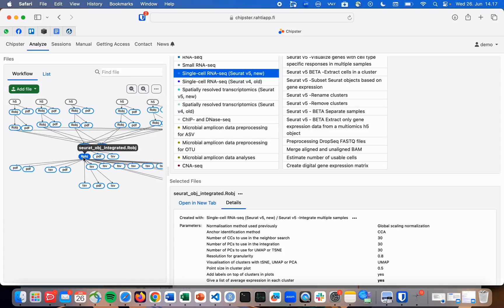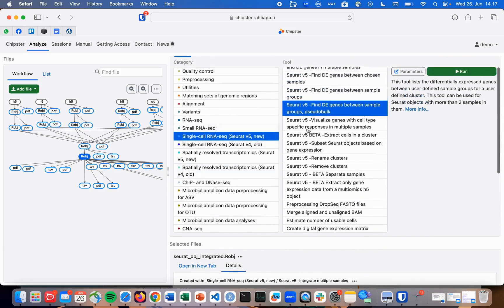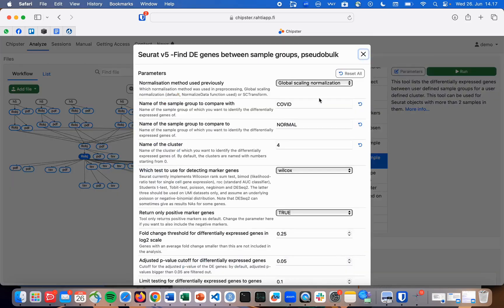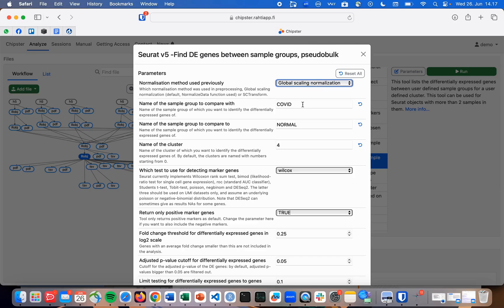We select the combined and integrated Seurat object, and then we choose the find DE genes between sample groups pseudobulk tool. In the parameters, we select the used normalization method and type the name of the sample groups here. Other parameters are similar to other DE tools.